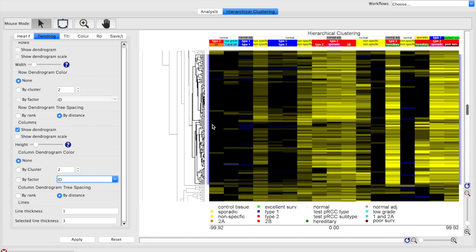So these are the genes I want to select. And it is my theory, given the fact that these fold changes seem to be similar over all these different comparisons for these particular genes, and that they seem to be more active in the more severe forms, or the type 2 versus the type 1, I think that they are acting together, that they are enriched for biological units, pathways, connections. And so what I want to do is pull these genes out and put them into another program where we can actually put the network together.